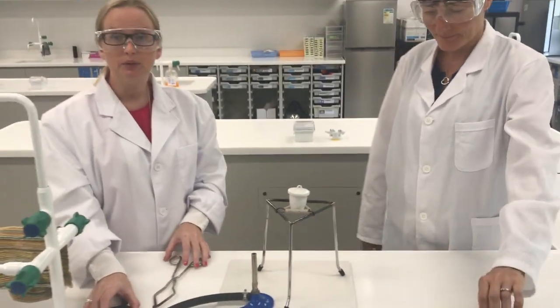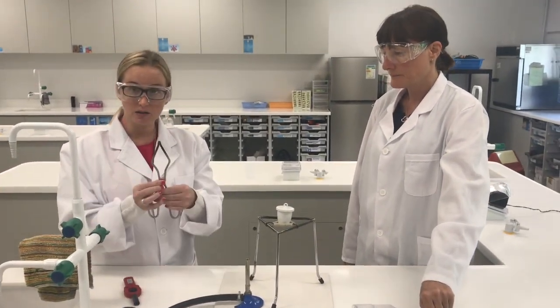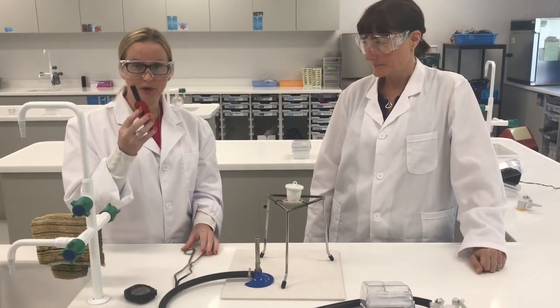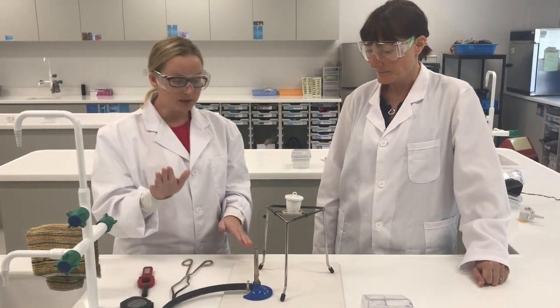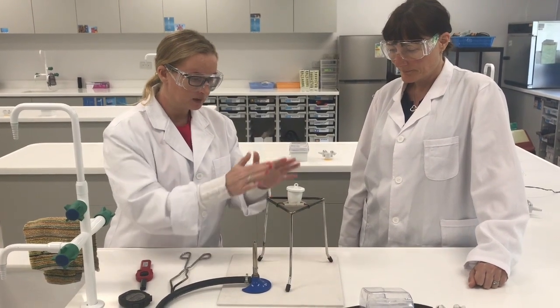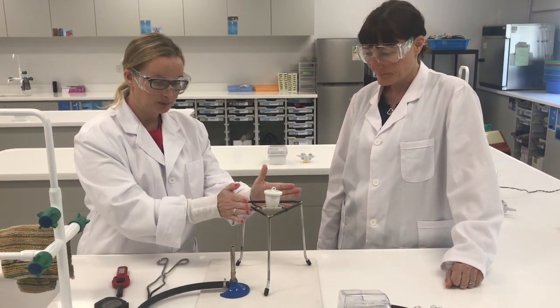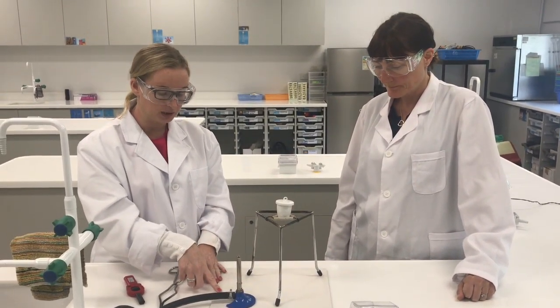You will also need a stopwatch, tongs, and a gas lighter for lighting the Bunsen burner. Make sure that initially on the heat proof mat, the setup with the tripod, clay triangle and crucible is kept to one side, and the Bunsen burner is slightly towards the edge of the heat proof mat.